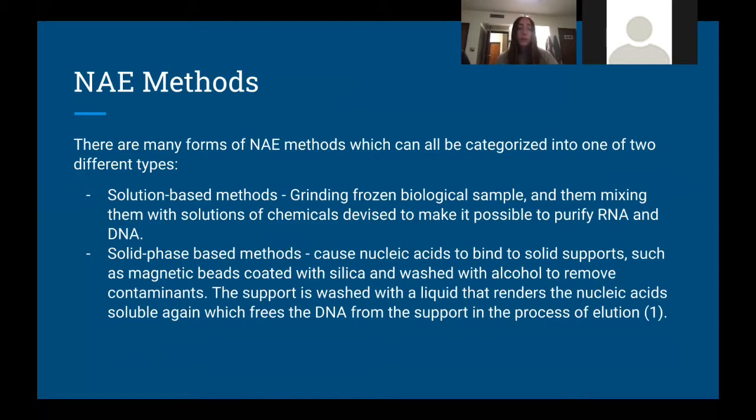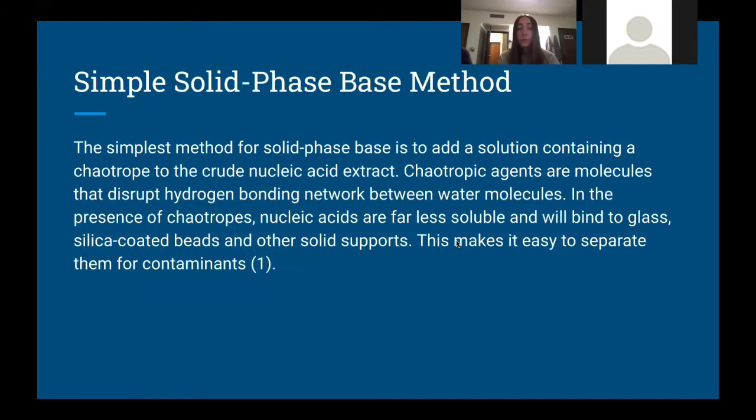Solid phase-based methods cause nucleic acids to bind to solid supports such as magnetic beads coated with silica and washed with alcohol to remove contaminants. The support is washed with liquid that renders the nucleic acid soluble again, which frees the DNA from the support in the process of elution.